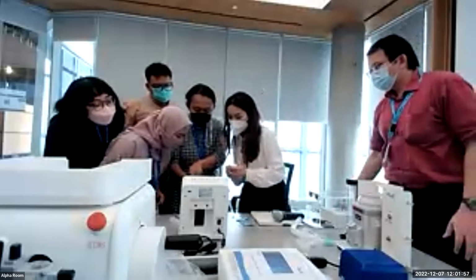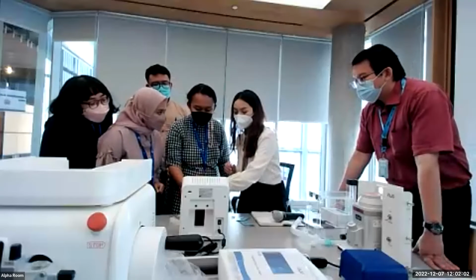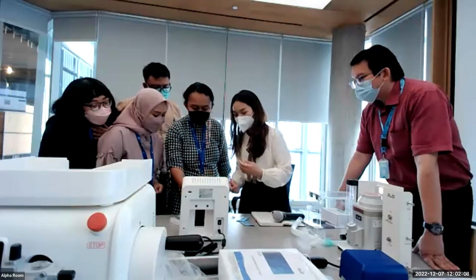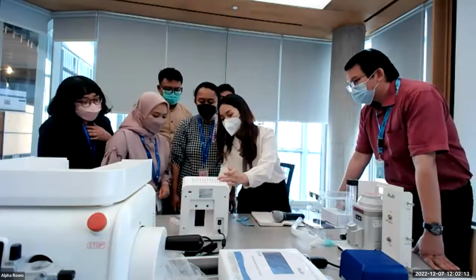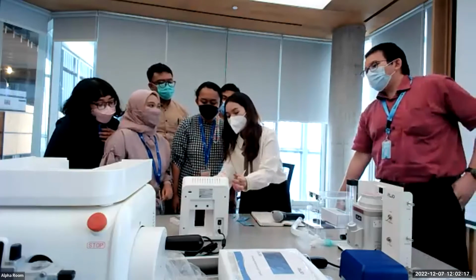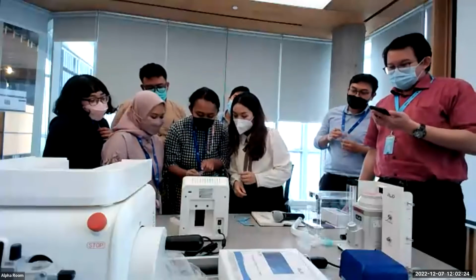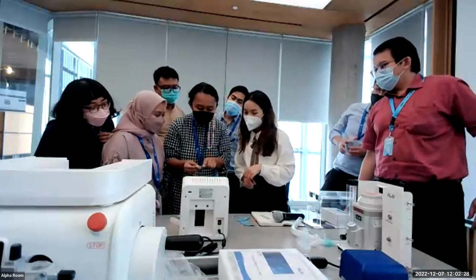The AB with like what on this side? Yeah, because this 2 chambers, so you can use 2 times. So you can inside here, and after that you can use this part. For this side, they read B side. And if this one, they read A side.